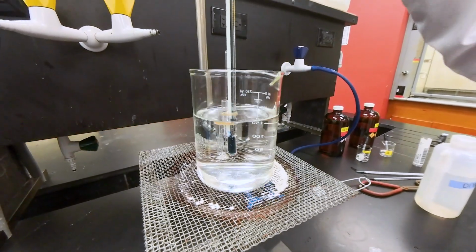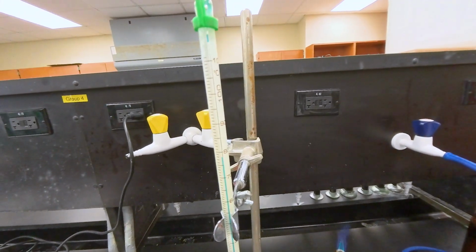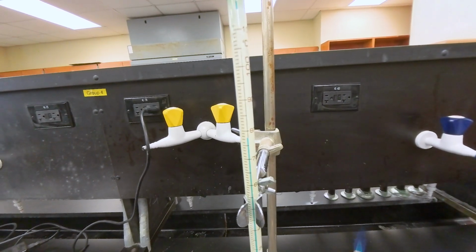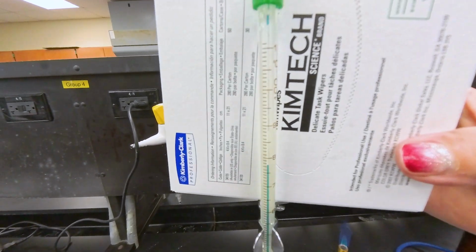Okay, the bubbles stopped. Now we can record this number for the boiling point. And it is very close to the boiling point of the known sample.